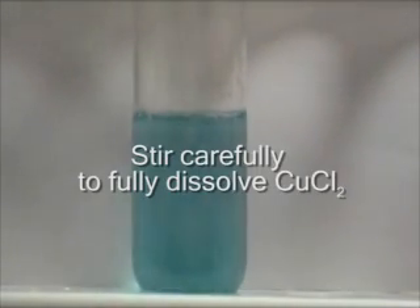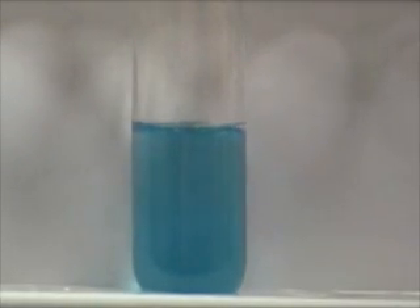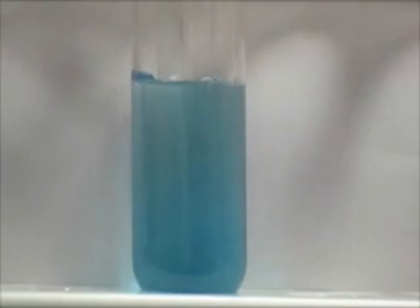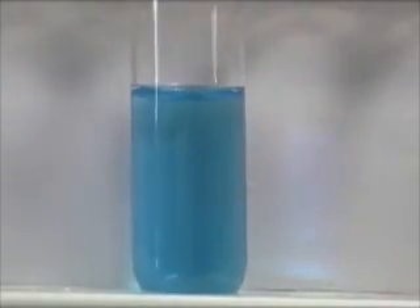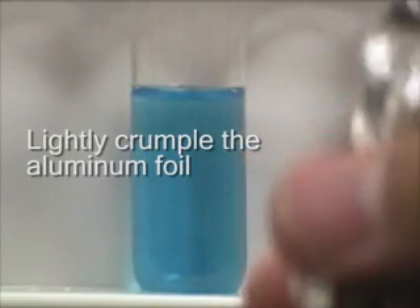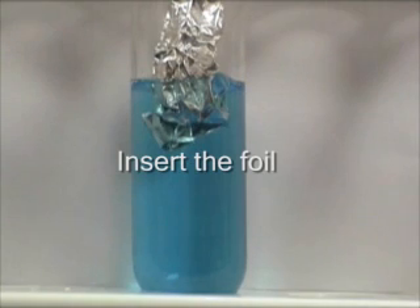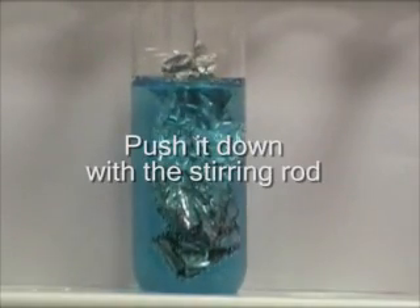Stir carefully. Be sure that all the CuCl₂ is dissolved in the water. Crumple up the aluminum foil and insert it. Submerge the aluminum foil completely with your glass stirring rod.